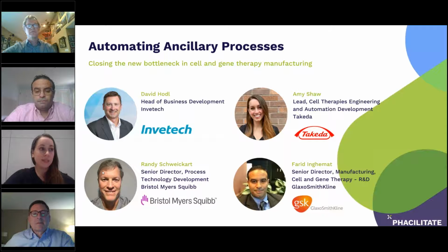Amy, your thoughts? Yeah, I agree with the panel here. I think we're at an interesting point. Cell therapy is getting bigger and bigger, but we're still using things off the shelf that are coming in bottles. Everyone kind of indicated that media formulation is an issue for them, and things like serum coming in bottles, glutamine, etc. Cytokines are a huge issue for us. They're coming in small aliquots that you have to manually pipette a lot of times.